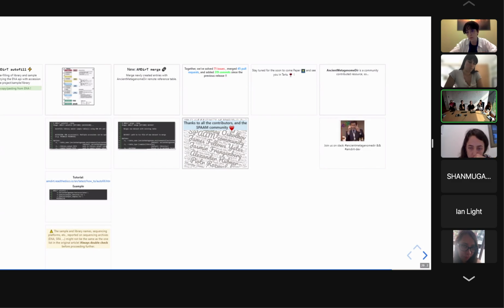So, put the very, very critical information, the very basic information, into a table in the supplements like here. Slight modifications to, I don't know, concentrations or volumes, that's maybe not so important. But the polymerase that's used, is it double-stranded or single-stranded, that's really critical, and that should go into a table, and not be hidden away in some text in the middle of nowhere, particularly when you start writing 500-page supplements.